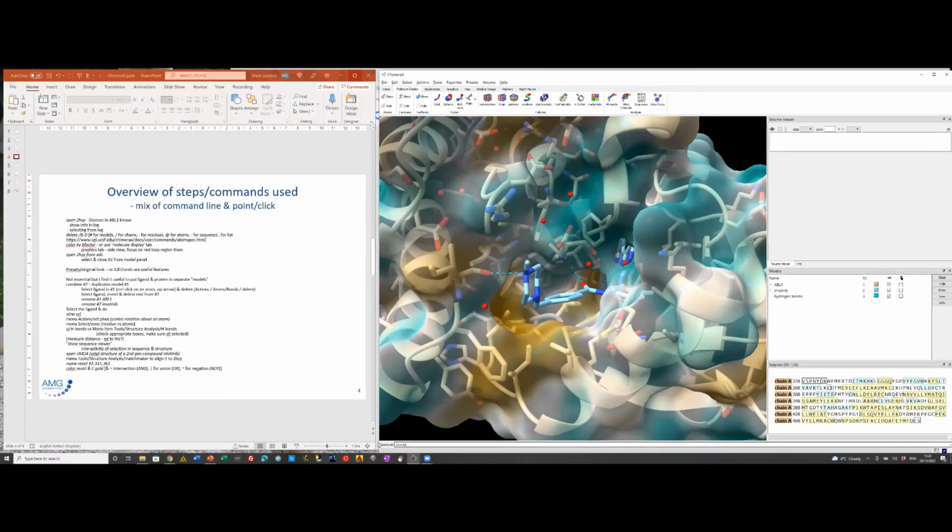or what can be very helpful is there's a command where you can name a set of something. This is only 2, so it's not too bad, but you can imagine if it was more than that, it would get quite unwieldy. But what's very useful is you can name the residues that you want to group together, and this is position 315 and 363.